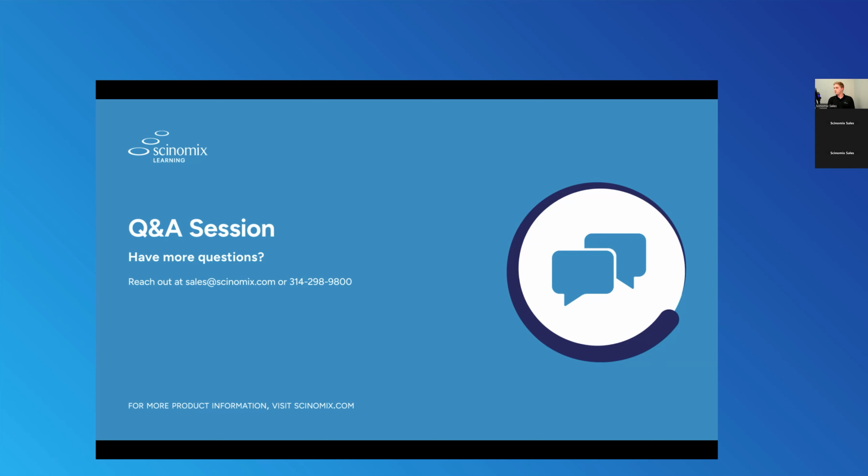Jolene has a question. What is the smallest volume it can aliquot? Yeah, like I was saying, most typically we suggest 5 microliters, but you can go beneath that. This is a user selectable field, so if 1 microliter, if you can get it to work, go for it. It's absolutely capable of doing it. Just again, whether or not those error rates are increasing is of concern to us.